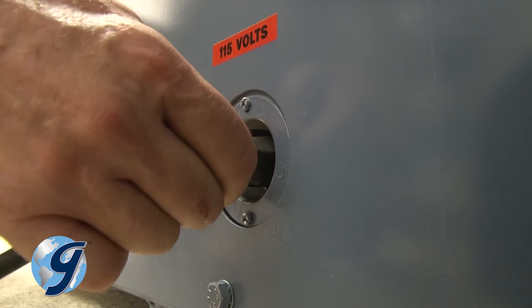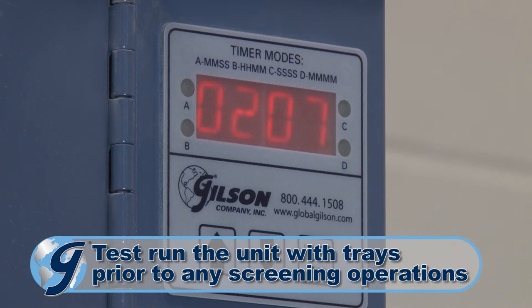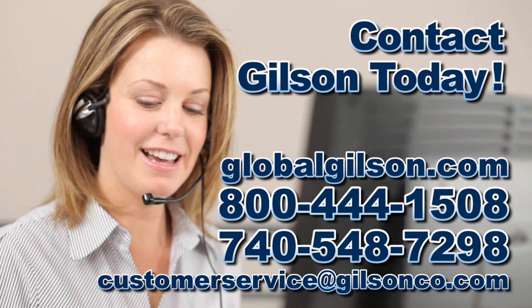Now run the TestMaster to confirm proper operation. The TestMaster testing screen is now ready for operation. For any questions concerning the Gilson TestMaster testing screen or for any other Gilson product, please contact the Gilson technical support team.